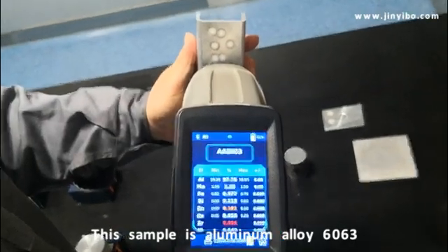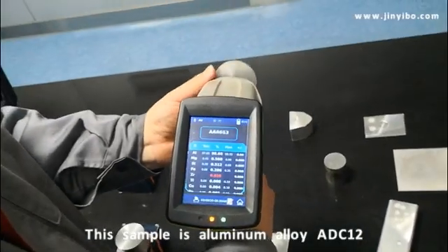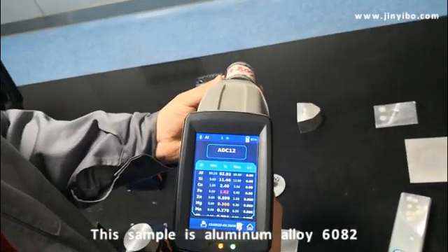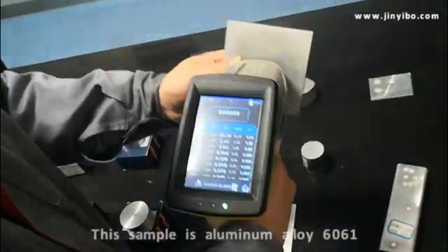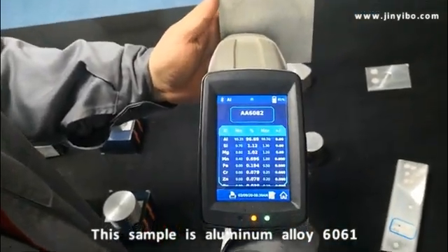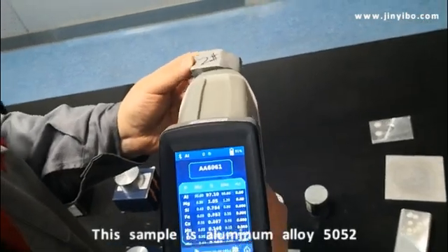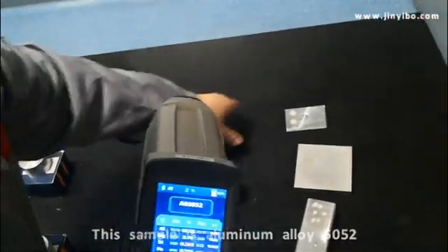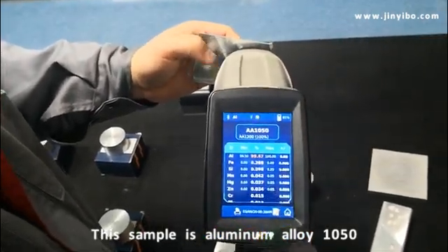One second — the result is out. Another custom sample — two seconds. The same example, and here, and this — 5052. And this one, the last sample — 1050.